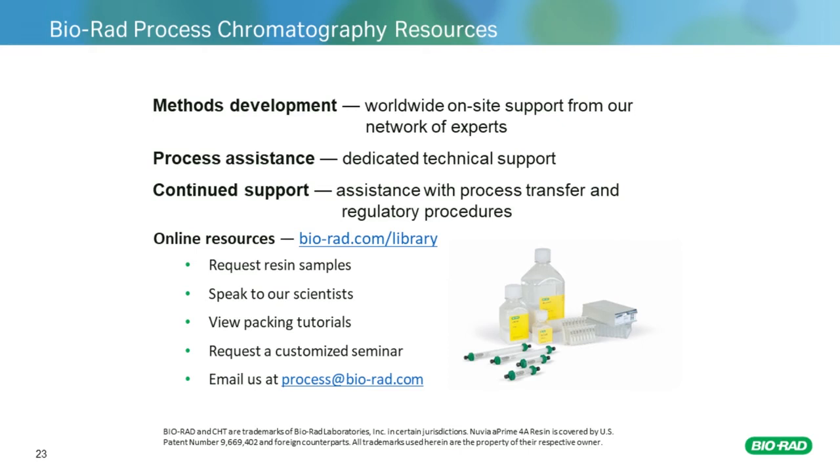Okay, and can DOE results be analyzed without the need for an analysis software program? To be honest, in order to do more quantitation of the parameters' effect on the purification, you will need the software. And if you currently do not have access to the software, you can reach out to us and we'll see how we can assist you. Another point I want to make is, if you completed your DOE study and would like to discuss data interpretation, further method development optimization, or scale-up strategy, please do not hesitate to contact us.